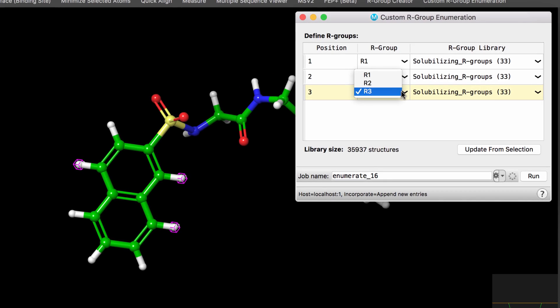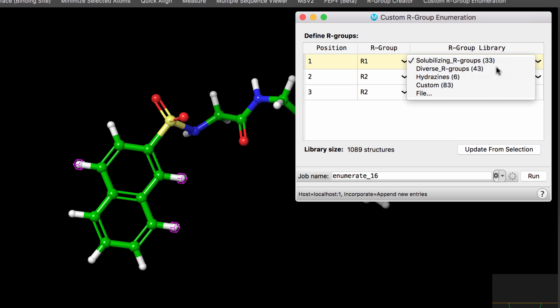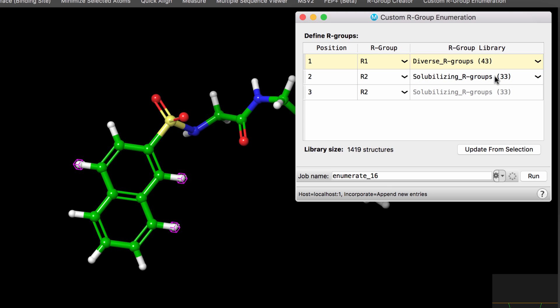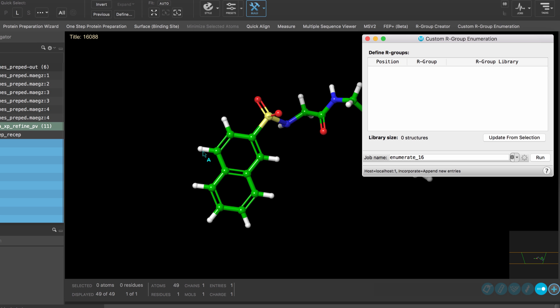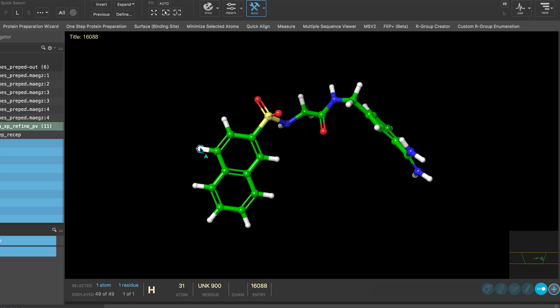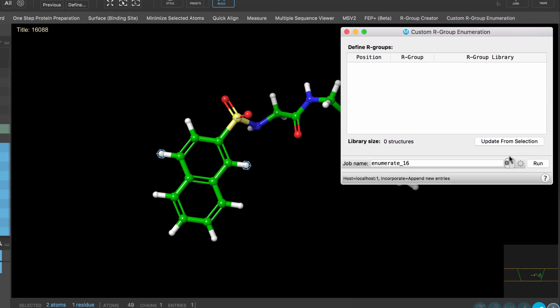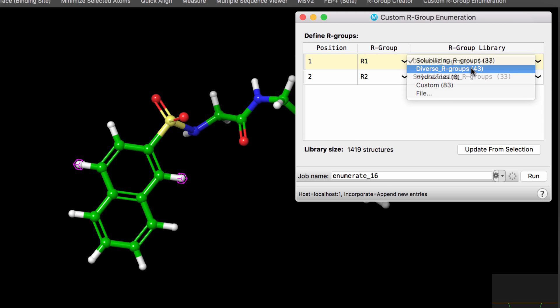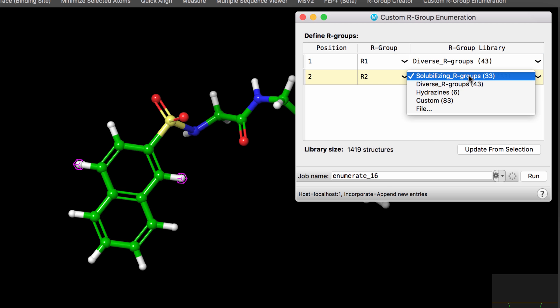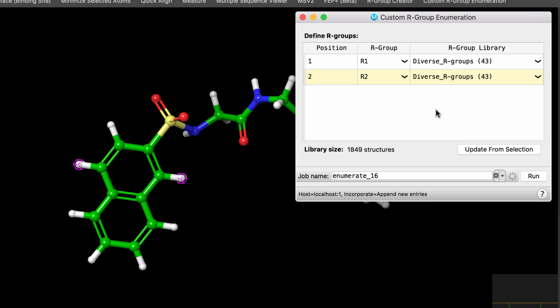Since the introduction of Maestro 11, the custom R-group enumeration panel has allowed for quick and easy R-group enumeration of ligands, where one simply selects the attachment points on a workspace ligand to define the R-groups, and then chooses one of the default fragment collections or R-group libraries to use for the enumeration.